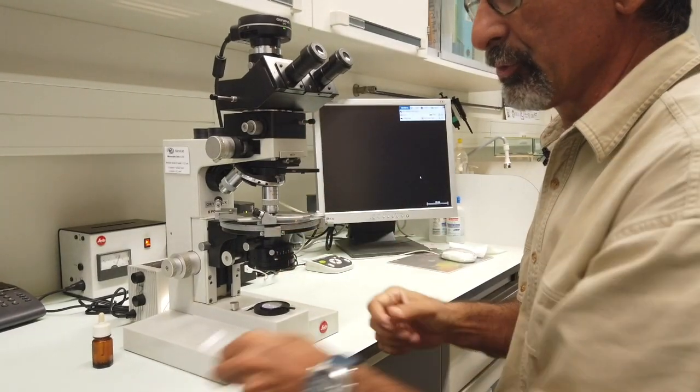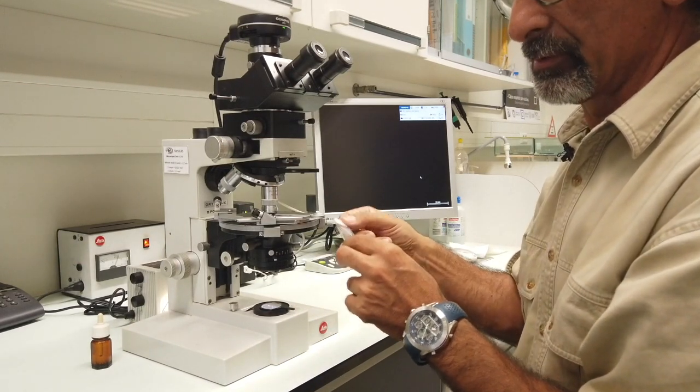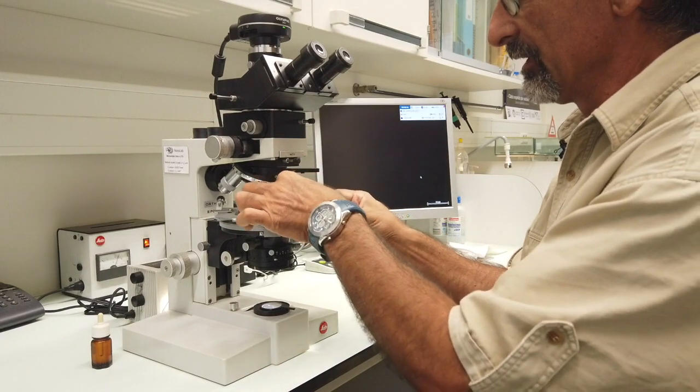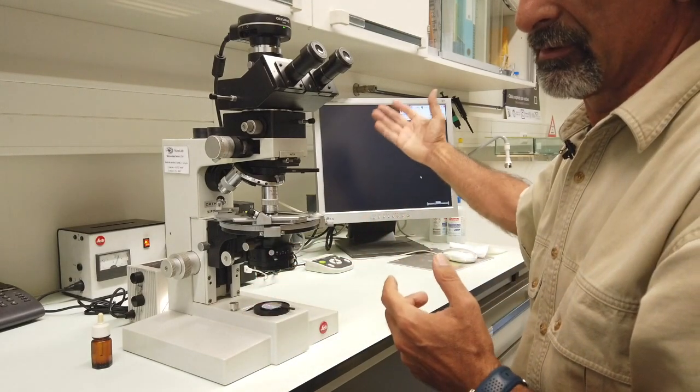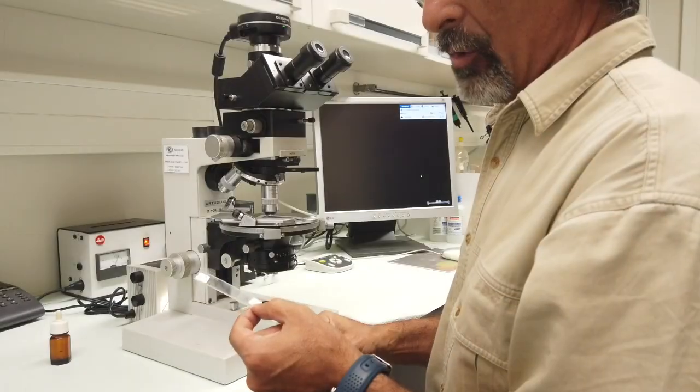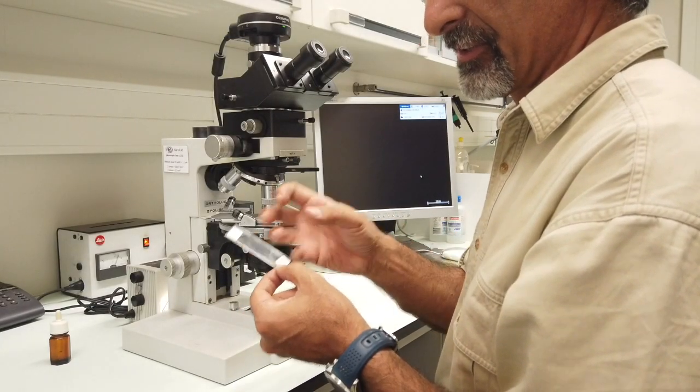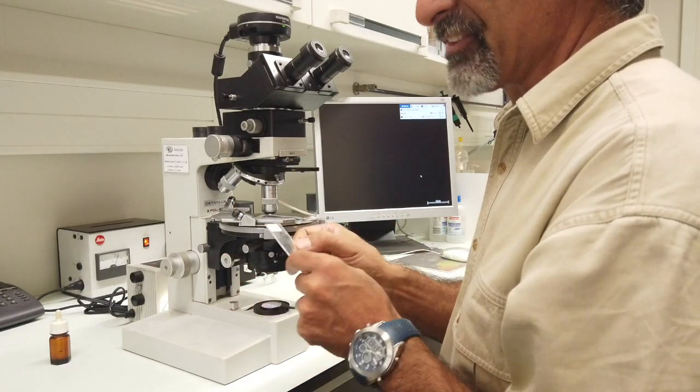If we introduce something that is isotrope, like some glass or organic material in the middle, they don't interfere with light and so the field becomes dark or continues dark. So now let's insert a sample with calcareous nanofossils that are composed of calcite and anisotrope mineral and see what happens.